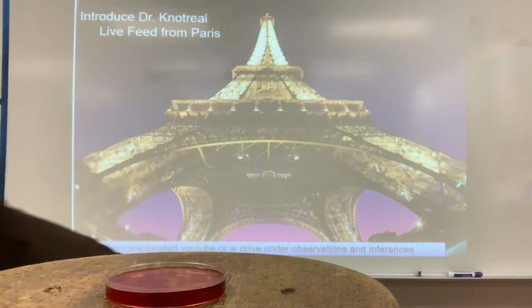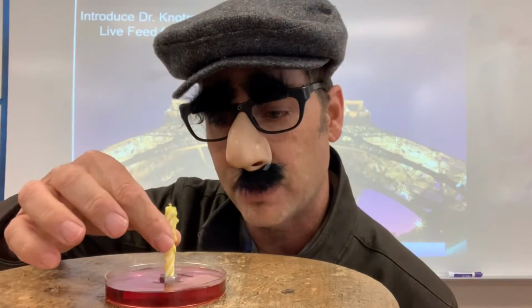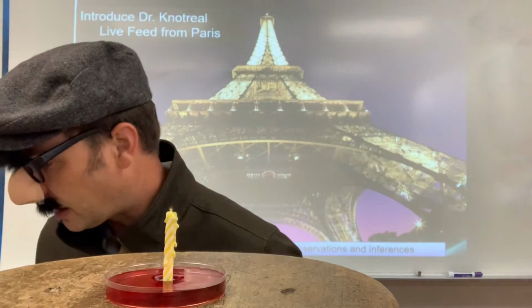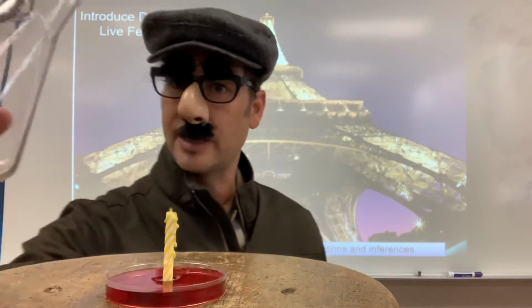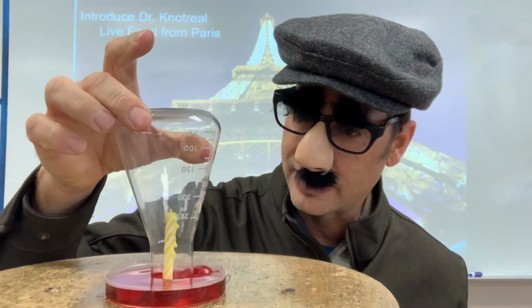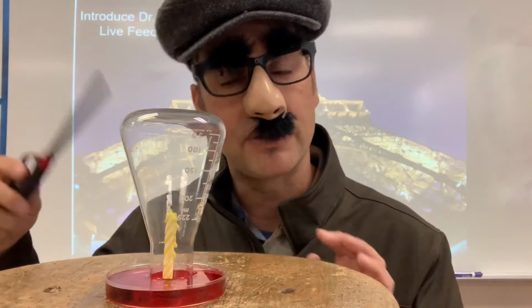And then you are going to take a birthday candle, a birthday candle that has a hex nut on it. It looks like this, and put it right here. So now you are going to get a flask. It looks like this, and you're going to place it upside down like this, and then eventually you will light the candle, but not right now.